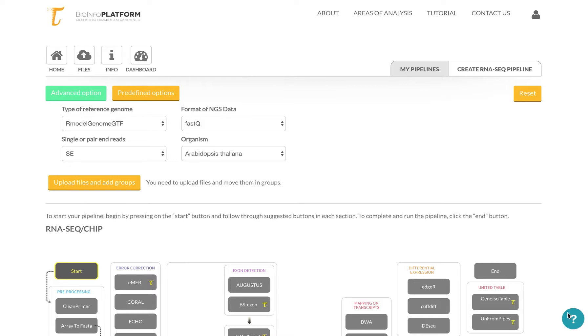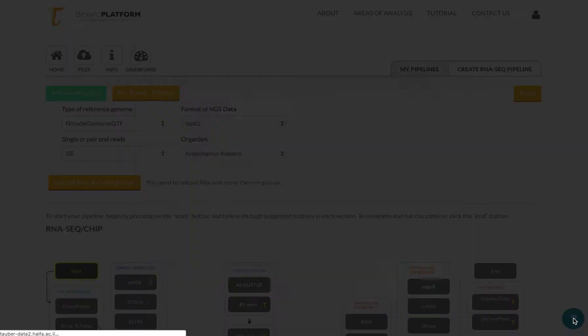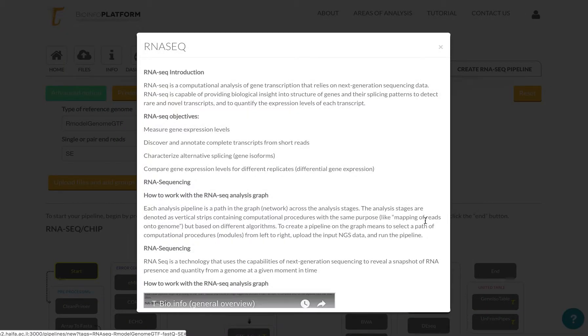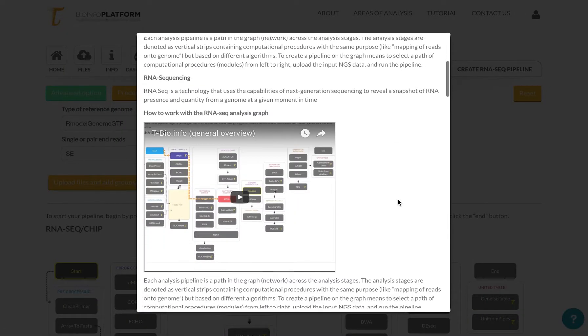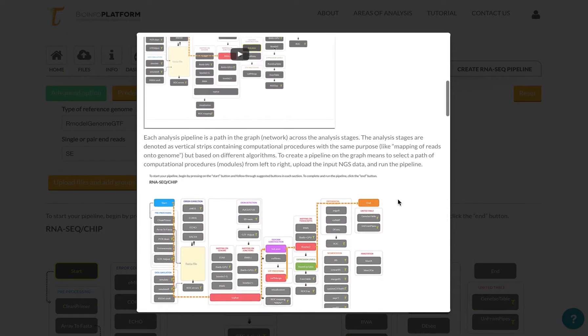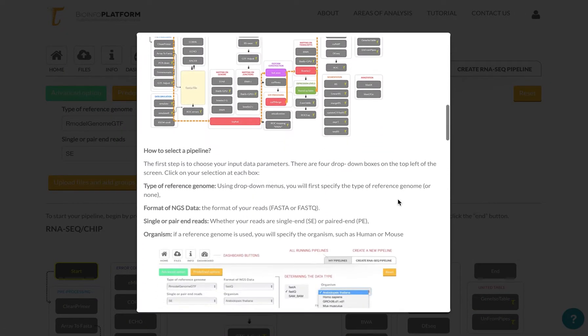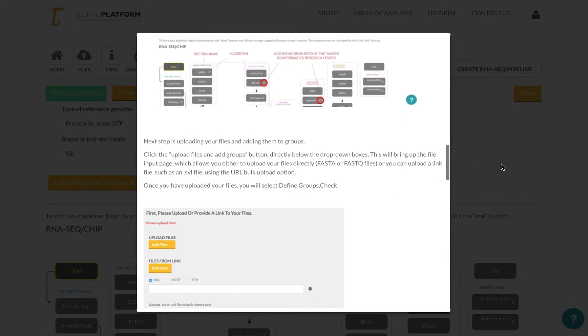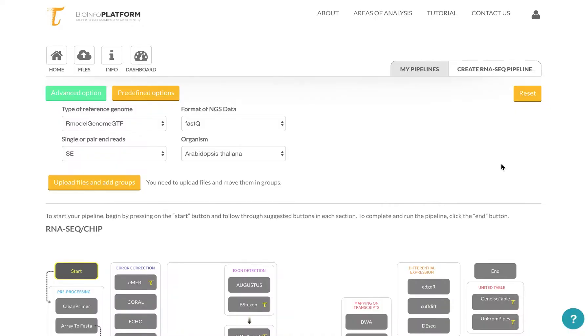You can always go to this question mark and see guidance on how to use this section in this little pop-up. But let me show you quickly how to upload the data and start your pipeline.